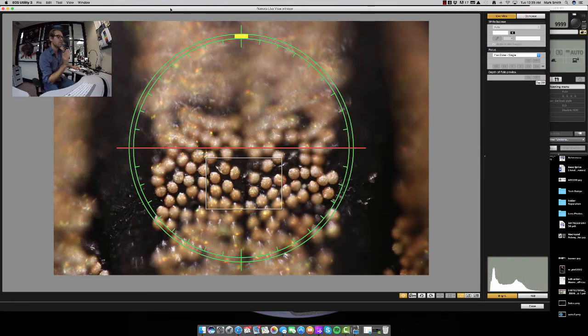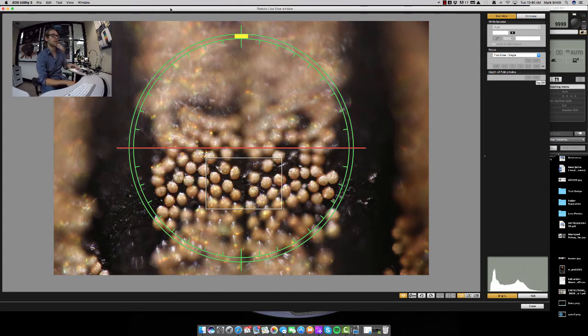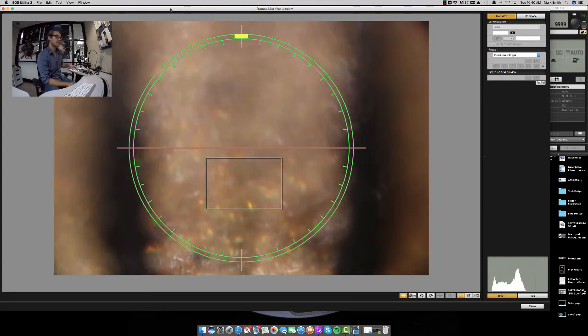One more thing I'll just point out: on the 10x objective I showed you how bad direct light can be on a sample that's as reflective as this one. One thing I always like to do is demonstrate how these diffusers are working by placing my hand in front of the direct light path from this light to the Weevil. I'm just going to slowly move it until the direct light is blocked by my hand — and there you go. You can really see how even the light becomes across this sample. That's what we're replicating when we have these little foam pads on the side. We don't want any direct light, we don't want any bright glare coming across, especially when you're focus stacking. We're going to continue to move the beetle backwards until everything goes out of focus again — now we can't see anything in focus, so that's a good safety end position.